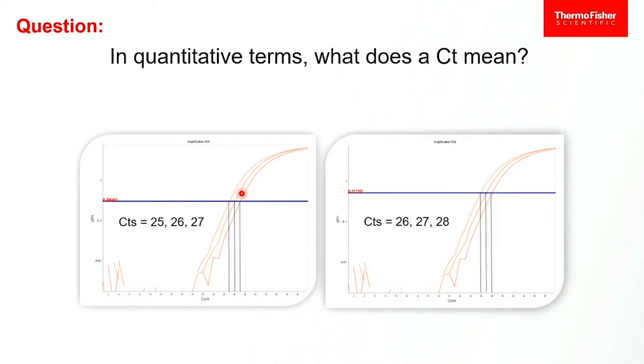You can't just walk up and do an experiment and say, well, it was 25 today and it was 26 the day before, so clearly that's different. That's not the same thing. If they're on different plates, run at different times with slightly different analyses, that means absolutely nothing. If they're on the same plate, run at the same time, now you have meaning because you're comparing.